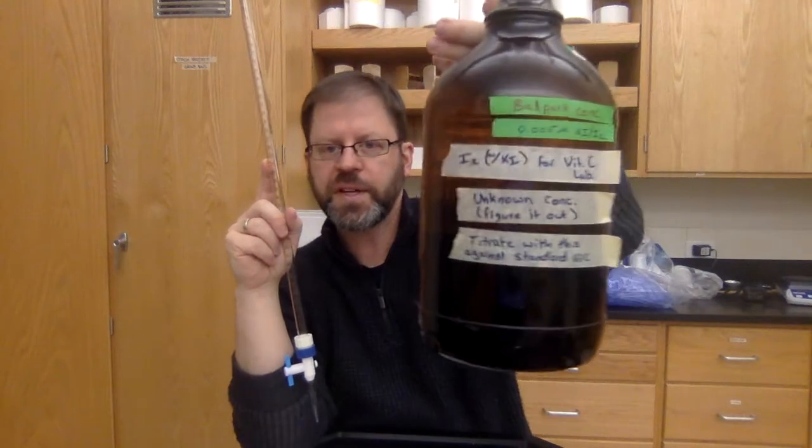Start with the knowledge that this is approximately 0.005 molar, and it's I2 and I minus, KI in it. And you want to use approximately 25 milliliters. So you got to figure out how much titrant is that, and what would be a good amount of vitamin C to match that amount of titrant.